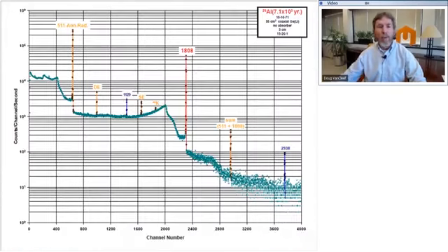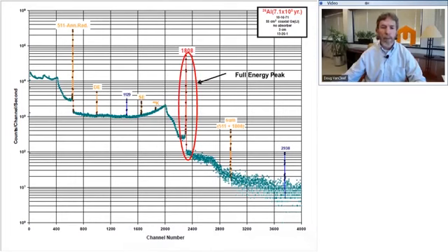If all of the gamma rays interacted with our detector only by photoelectric effect, all we would get is full energy observation of the interaction. When we have a collection of observations, we call that a peak, thus the name full energy peak. Note that even for higher energy photons that do not interact primarily by photoelectric effect, we can end up with a full energy observation, as the other interactions that are possible may finish with a photoelectric event.